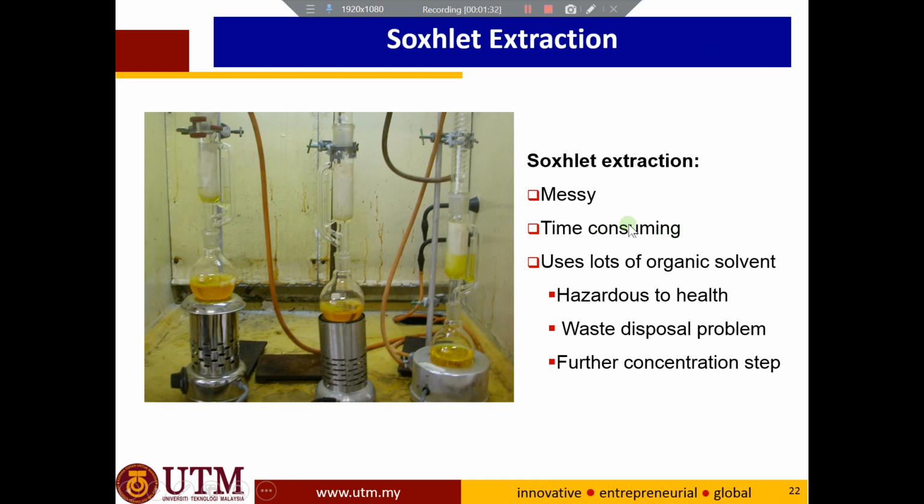It is time consuming; it will take days, it will take hours. It uses a lot of organic solvent that may be hazardous to health. We have the problem of disposal, and we need a further concentration step by using, for example, a rotatory evaporator.